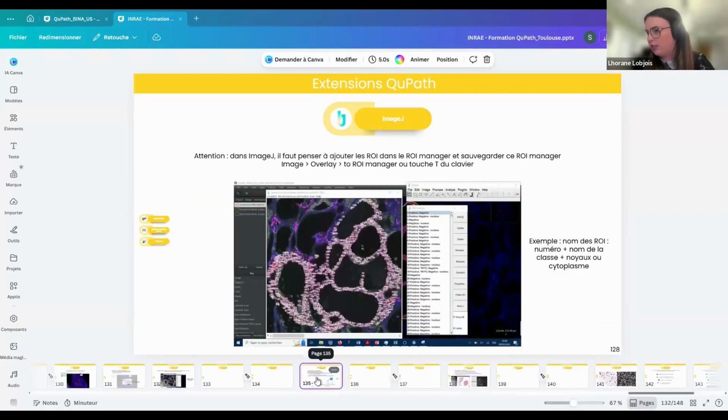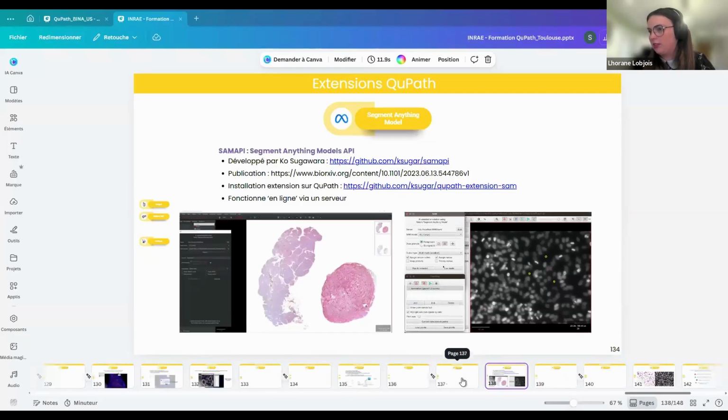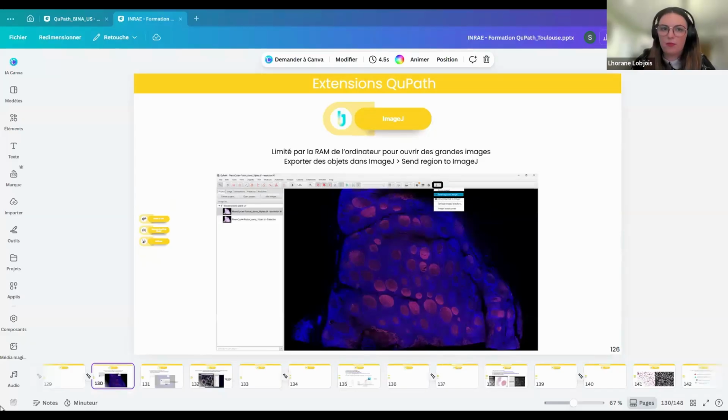In this one, no. StarDist is showing it on another thing. StarDist is for nuclei, and Cellpose should be both, but more used for cytoplasm or membrane. InstanSeg is more dedicated to multiplex images, or if you have a slow PC, because it works for nuclei and cells, so sometimes it's the best way to start.